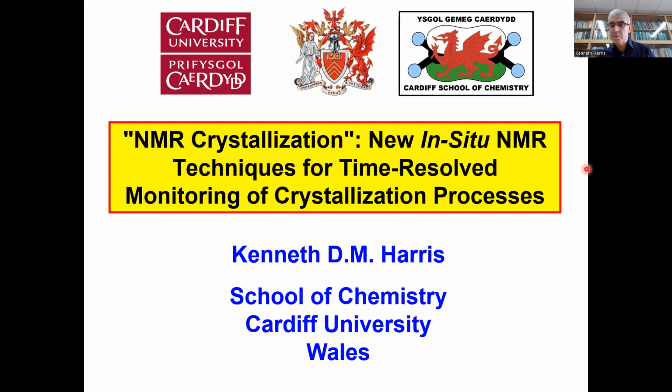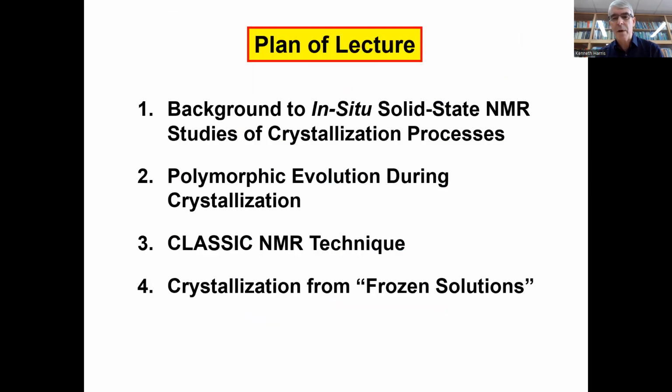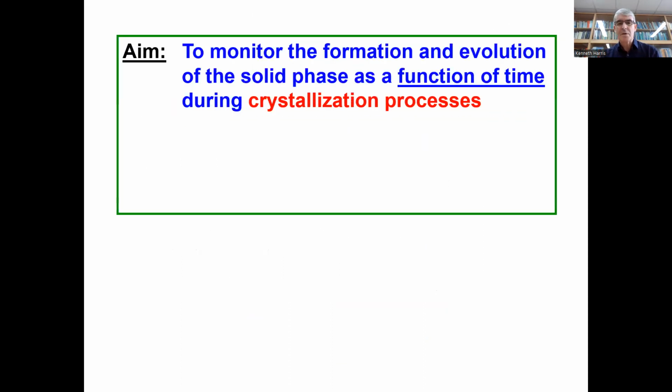What I'd like to discuss during my lecture is new in-situ NMR techniques that we've been developing to study the progress, time-resolved monitoring of crystallization processes. I want to give some background to these techniques, various examples of polymorphic evolution, new developments of techniques, and further applications through the lecture. Okay, so the basic idea is very, very straightforward.